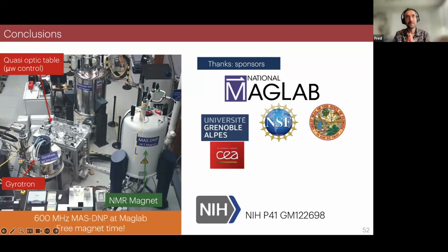It depends how rigorous you want me to be for that question. I would say I can hand wave the explanation here. Basically, with AsymPol POC, the polarization can go immediately from the nitroxide to the solvent outside. In that case, you don't need to relay through the protons on the molecule, meaning that the polarization transfer is faster outside than through the spin diffusion inside to outside.